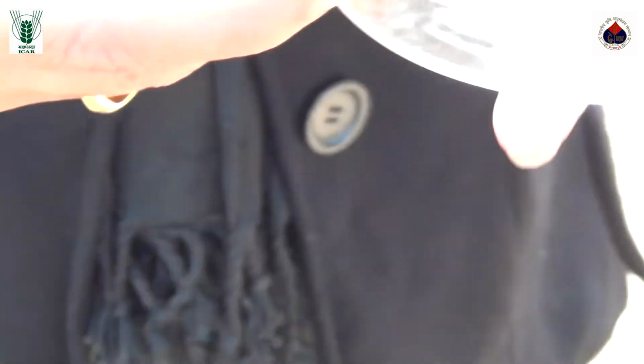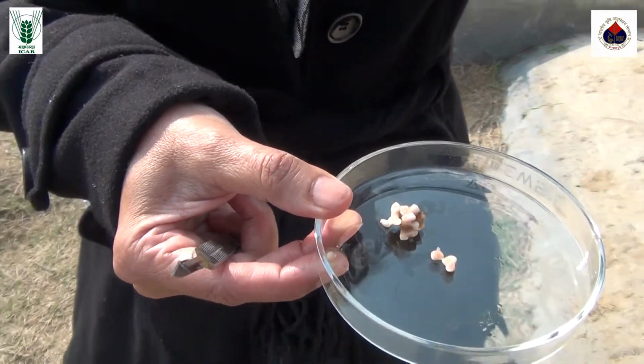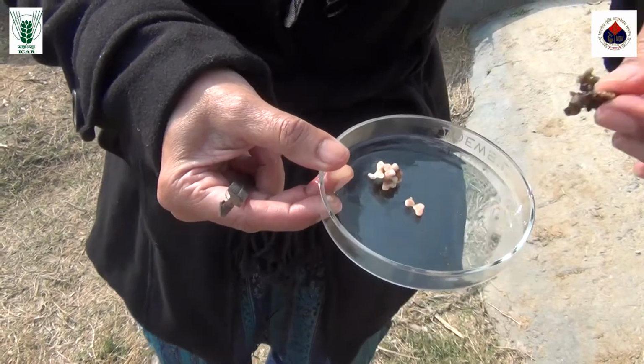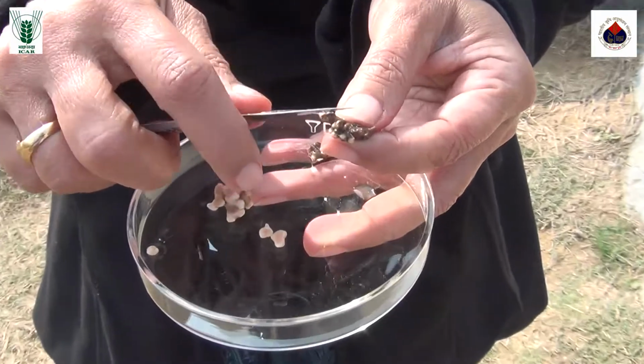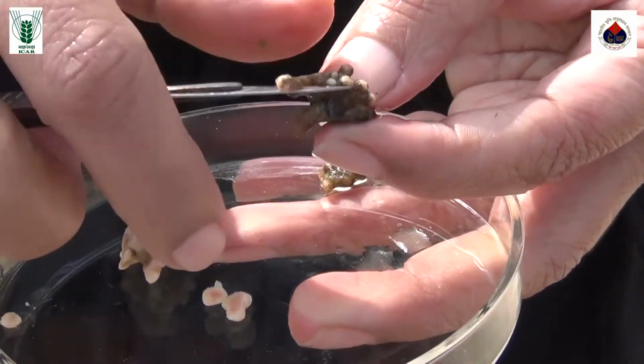Now I will show the one which is already a senesced nodule. So this is a senesced nodule. If I just cut it here, you won't find it.